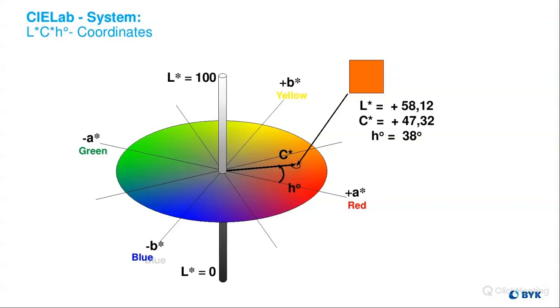Now, because everything's mathematical with the newer instruments, once you take that value of whatever color you measured, you can then put it into a software and change the equation on the software after you took the test, and it'll automatically put all the data into the right information for that exact equation. So you can change the equation after the fact or before the fact.